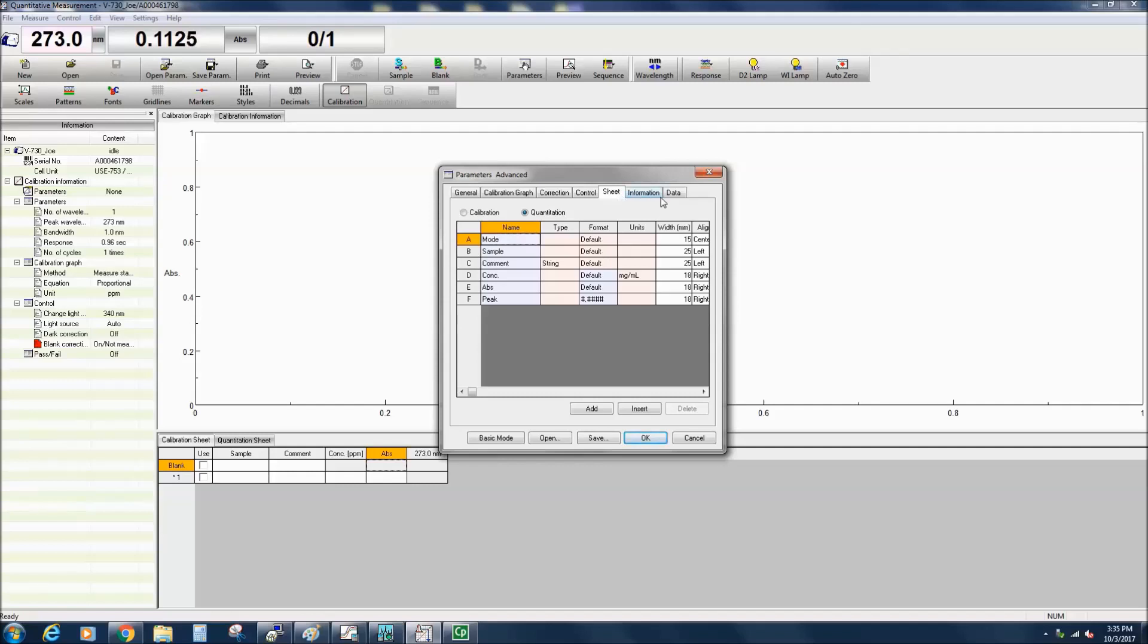The Information tab allows you to populate the desired fields such as Method, Comment, and User. These comments can also be displayed in the Comments dialog box before the sample measurement. All information provided here can later be viewed in the Information tab in Spectra Analysis.